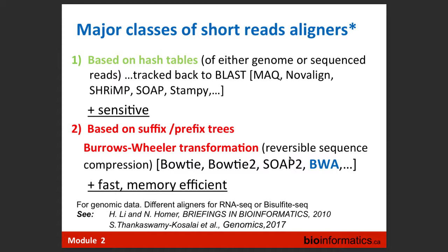And then I have my lookup table, and then I have my file. I take the first read from my file and check, is it available in my table? If it's available, yes, I find the coordinate. If it's not available, probably it's not aligned, or maybe there is a mismatch. That's when complications come.